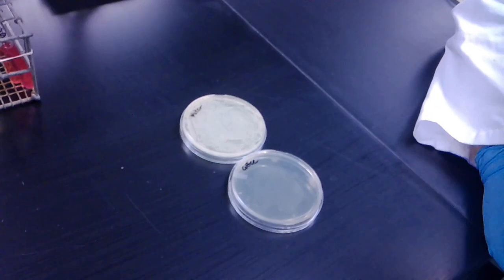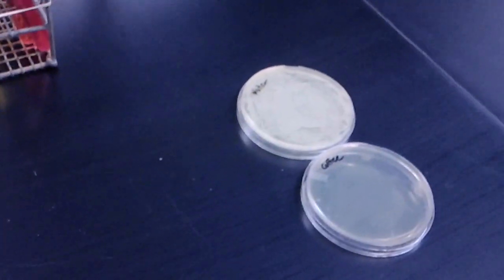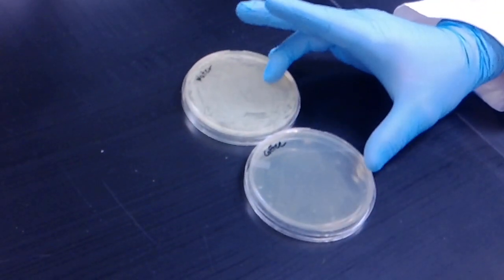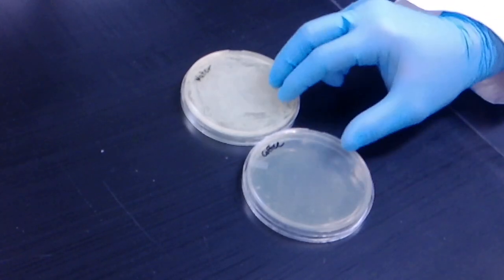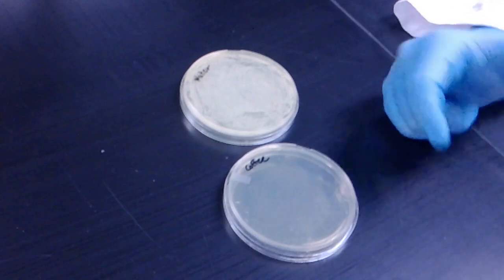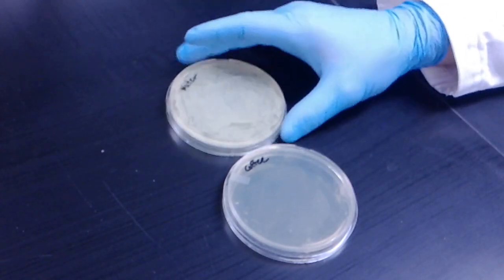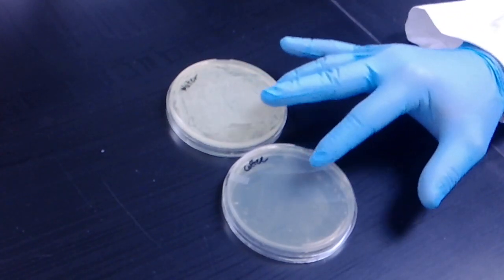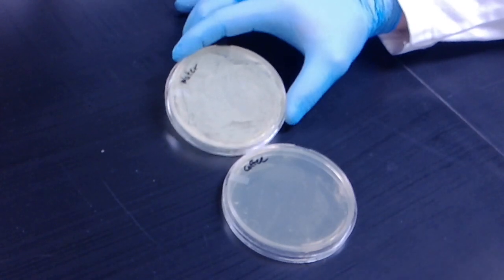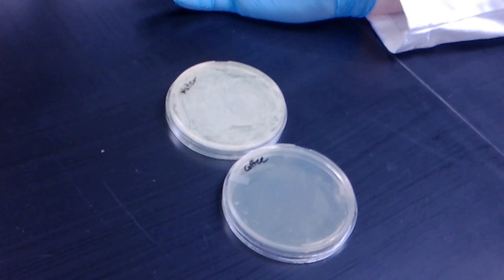Alright, so what we're looking at right here is just a fun little experiment going back to the microbes around us. So what we did in this experiment is we took a coffee and a water that were both relatively old. The coffee was sitting out for about a month or two in a closed container. And then we also added water. And these are both on TSA plates. So TSA nutrient agar. So what we wanted to do here is to kind of look at what microbes might be growing in each environment.